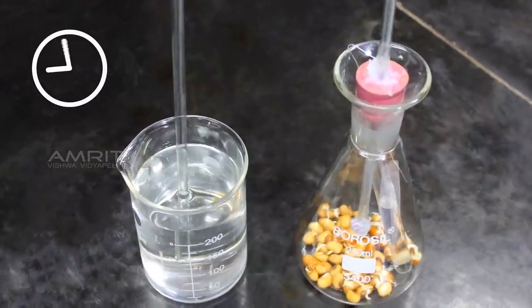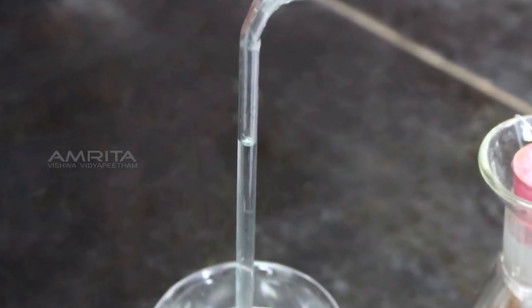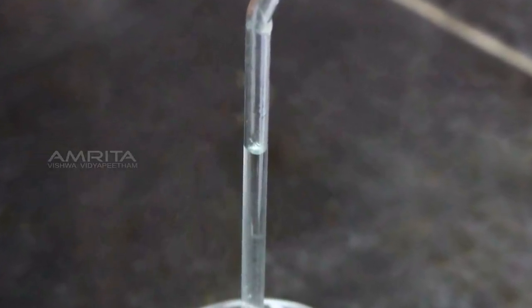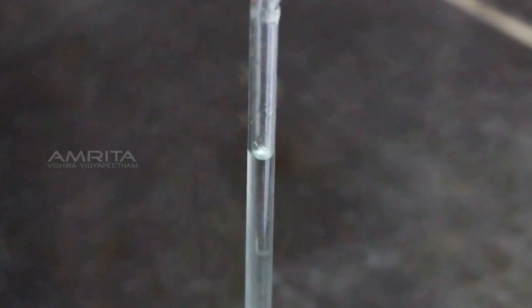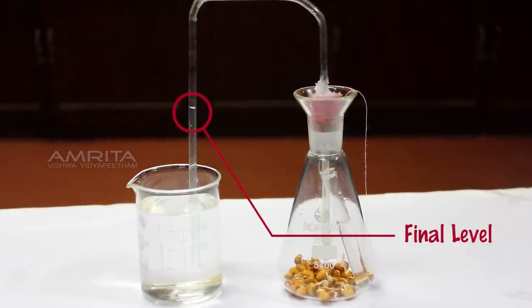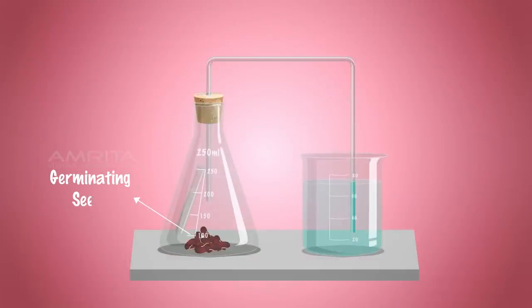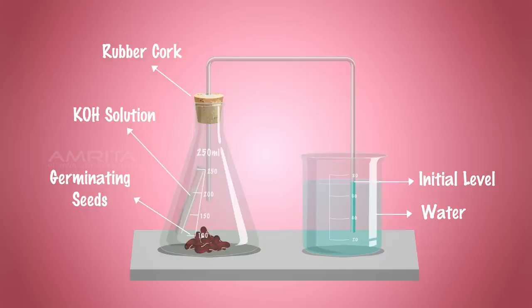Keep the apparatus undisturbed for 2 hours. After 2 hours, you will see that the level of water has risen in the delivery tube at the end dipped in the beaker of water. Note this level as the final level. The germinating seeds in the conical flask release carbon dioxide during respiration, which is absorbed by the potassium hydroxide solution kept in the small test tube. This creates a partial vacuum in the flask and it forces the water up the delivery tube. Thus, it proves that germinating seeds produce carbon dioxide during respiration.